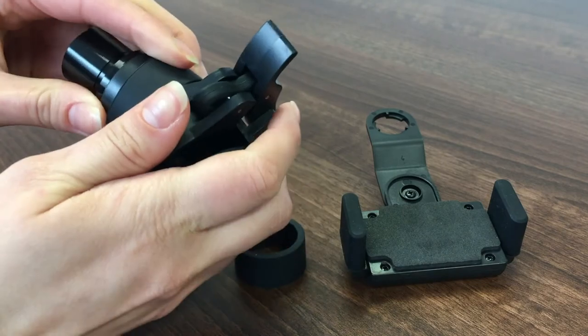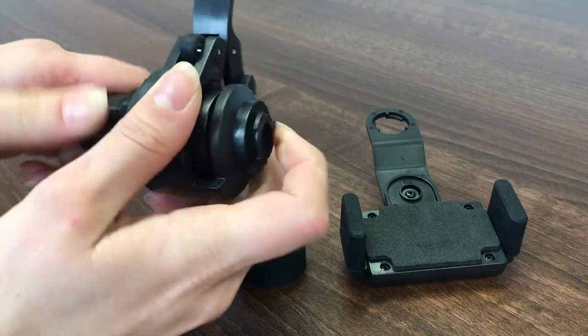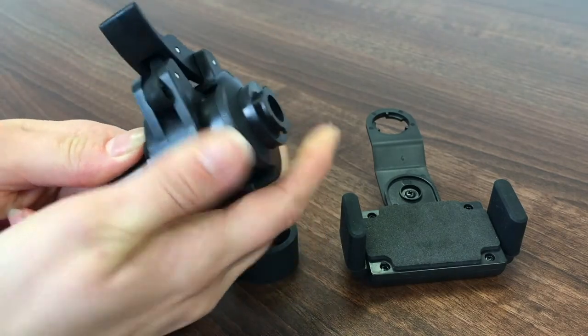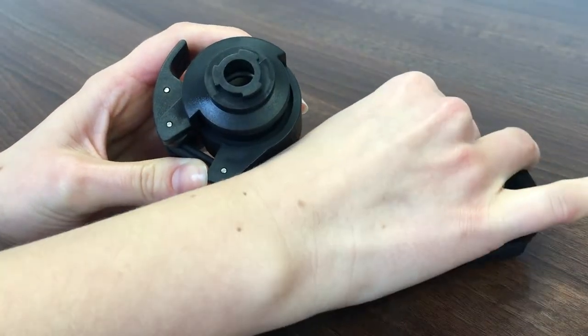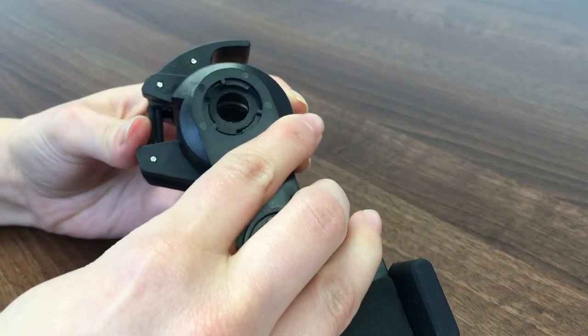Push the eyepiece into the eyepiece adapter cup so the eyepiece is flush with the end of the cup, and clamp into place so that the eyepiece is secure. Fit the eyepiece cup to the arm of the adapter and turn it anti-clockwise to secure in place.